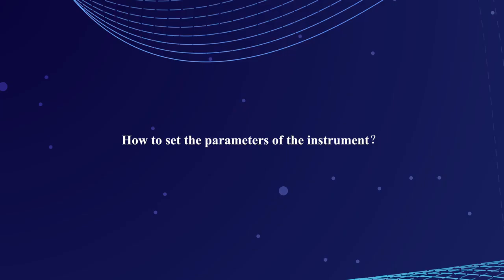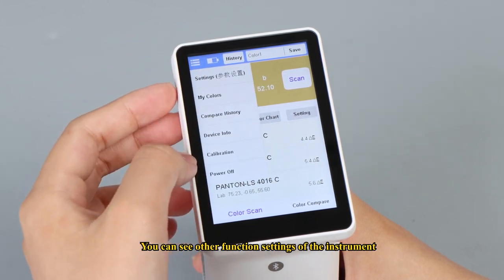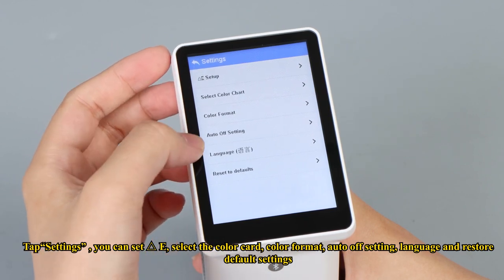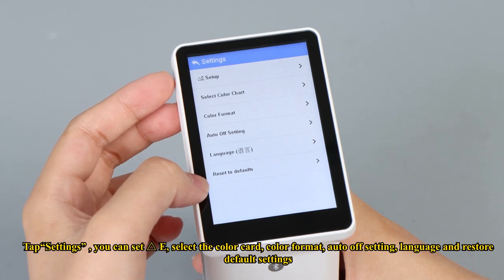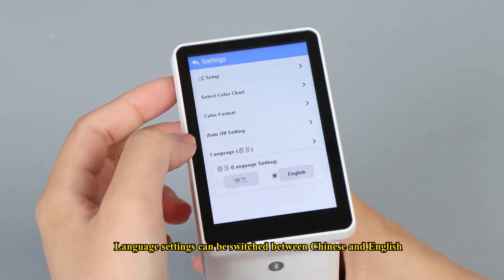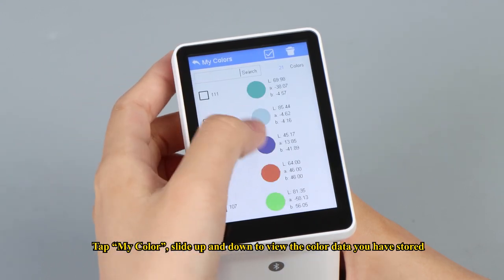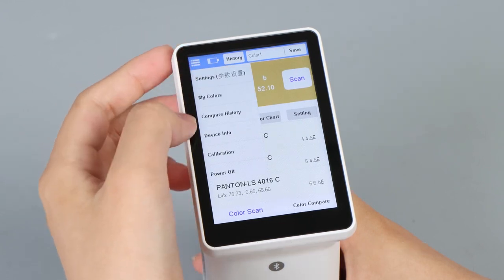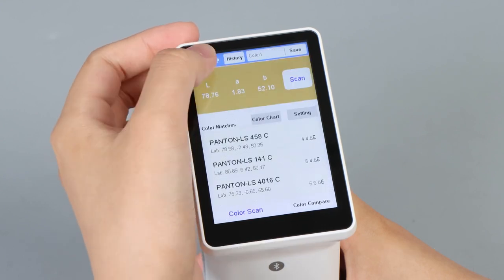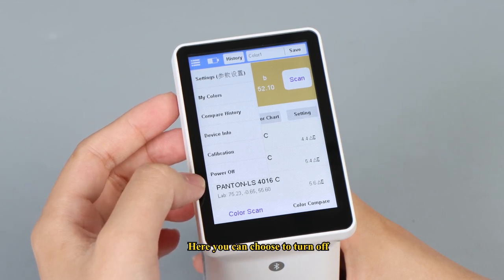How to set the parameters of the instrument? Click the menu button in the upper left corner to see other function settings. Tap settings to set delta E, select the color card, color format, auto-off setting, language, and restore default settings. The auto-off can be freely set from 1 to 30 minutes, and language can be switched between Chinese and English. Tap my color to slide and view stored color data. Tap compare history to view stored color difference records. Below is the device information, calibration, and power-off option.